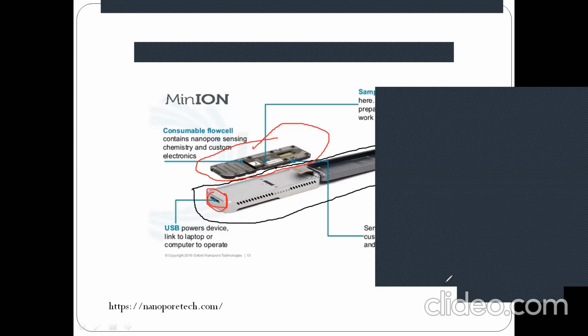But believe me, from my own experience, whatever we started running in the nanopore that we procured, we could run only 20 to 25 samples per flow cell, and after 20 to 25 runs, the flow cell got choked completely. So we had to open another fresh flow cell for further runs.